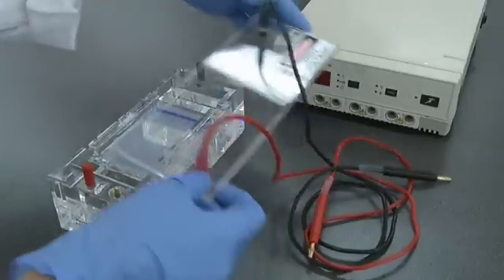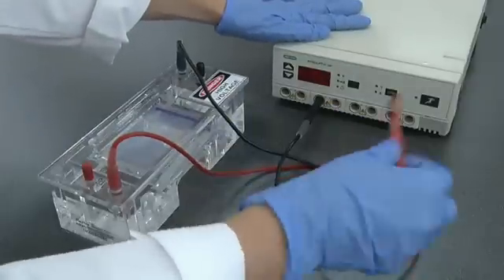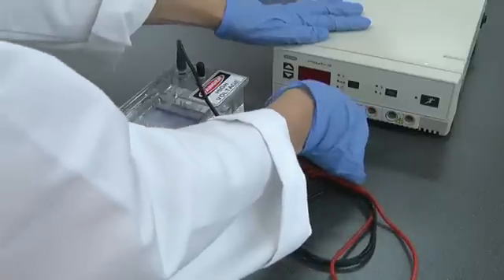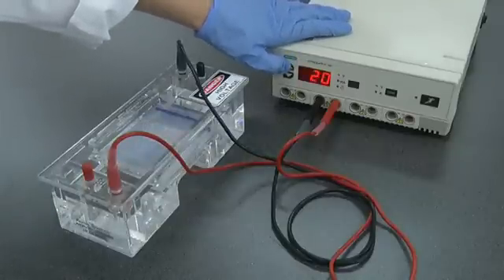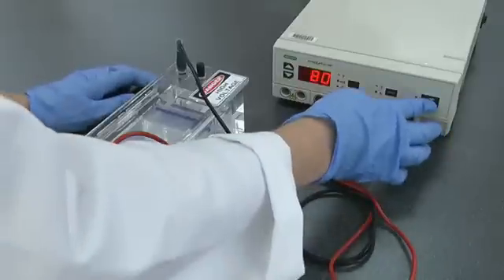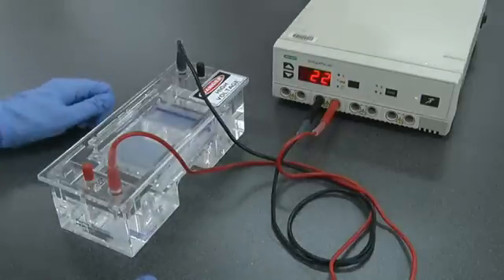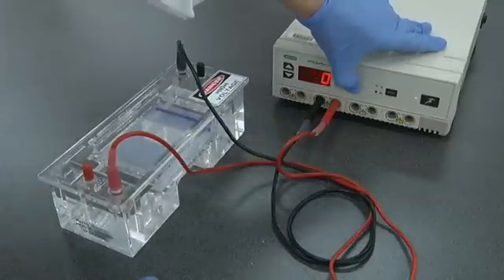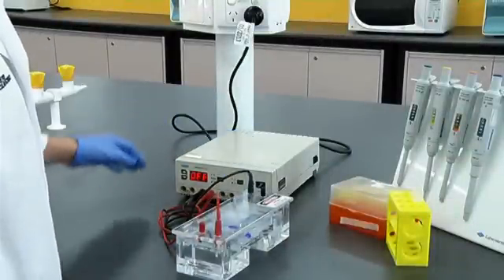Place the cover on the gel tank and plug it into the power supply. Set the appropriate voltage on the power supply and begin the run. You should be able to observe current on the power supply and also see bubble formation on the electrodes. When the run has finished, turn off the power supply and switch off at the mains.